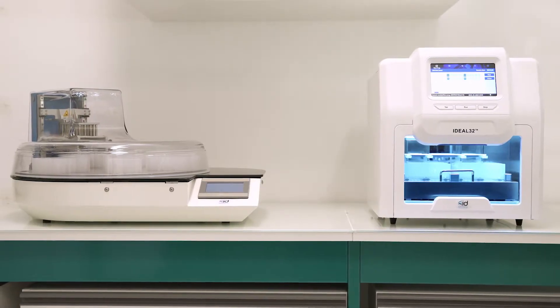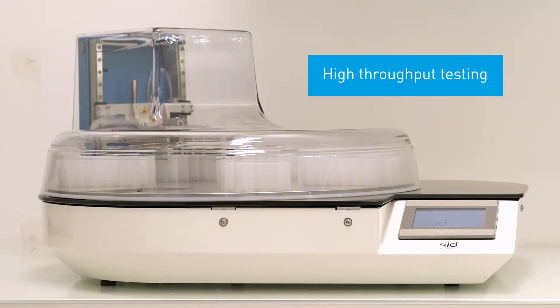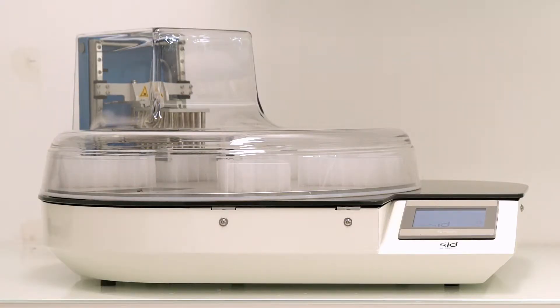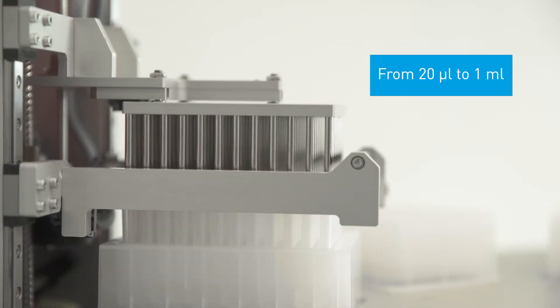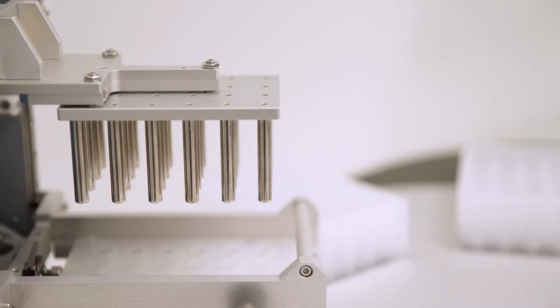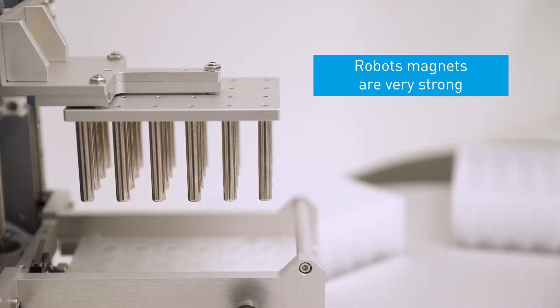More information about the robots themselves. For high throughput testing, the Ideal 96 machine extracts nucleic acids from sample volumes ranging from 20 microliters to 1 milliliter. The robot magnets are very strong to increase extraction capacity.